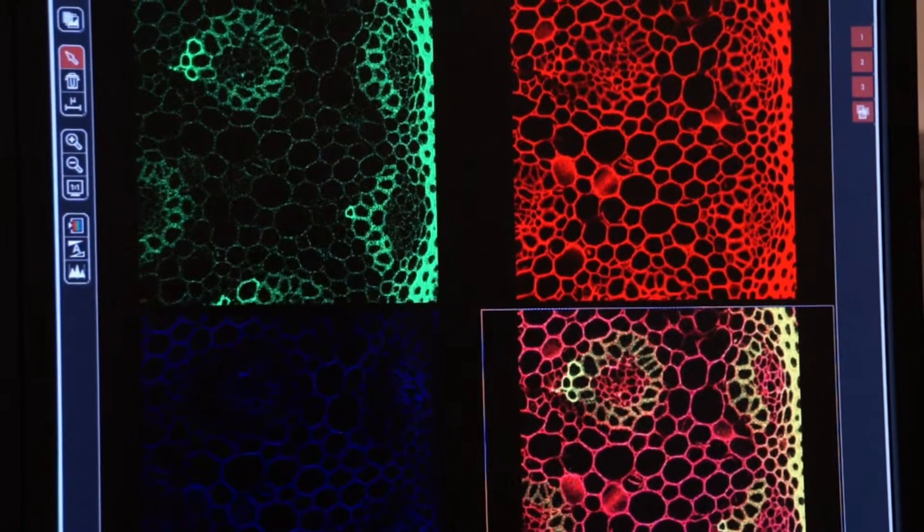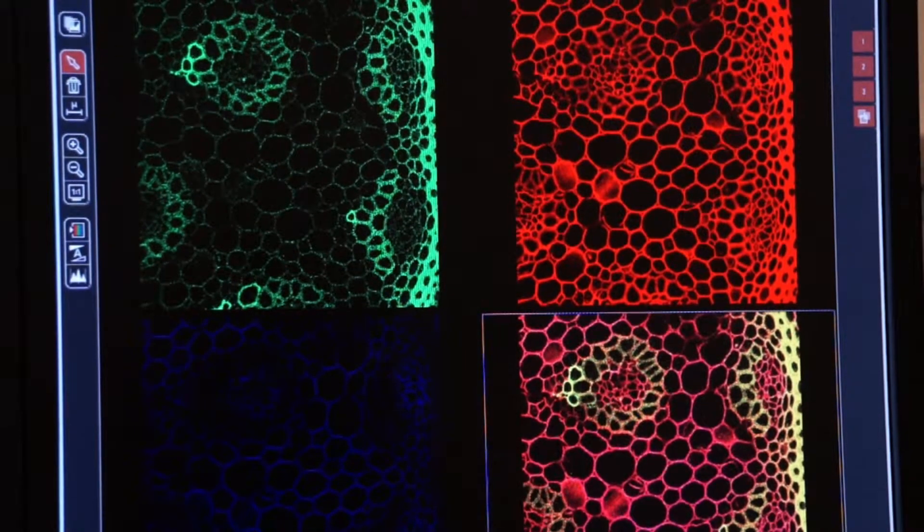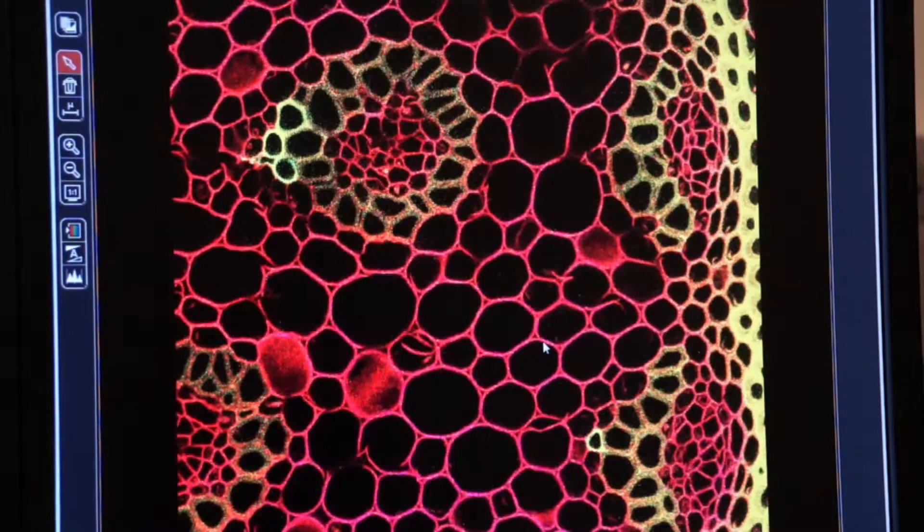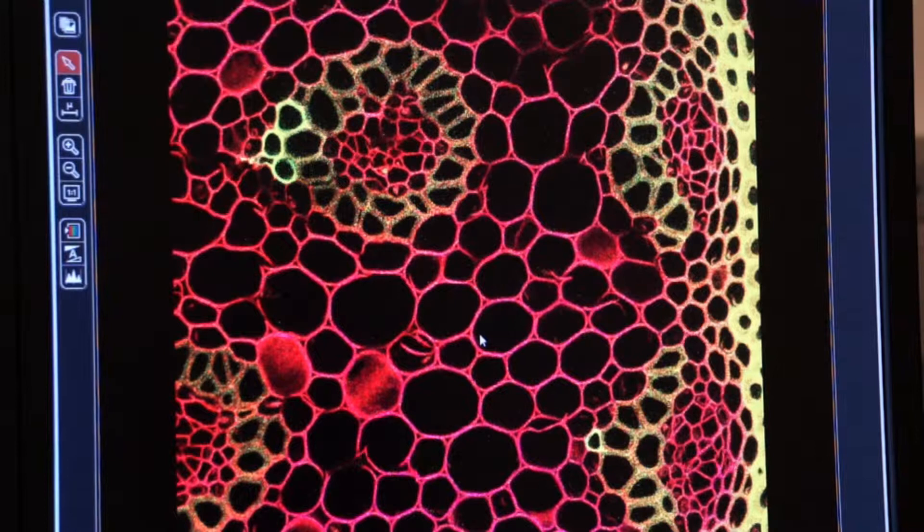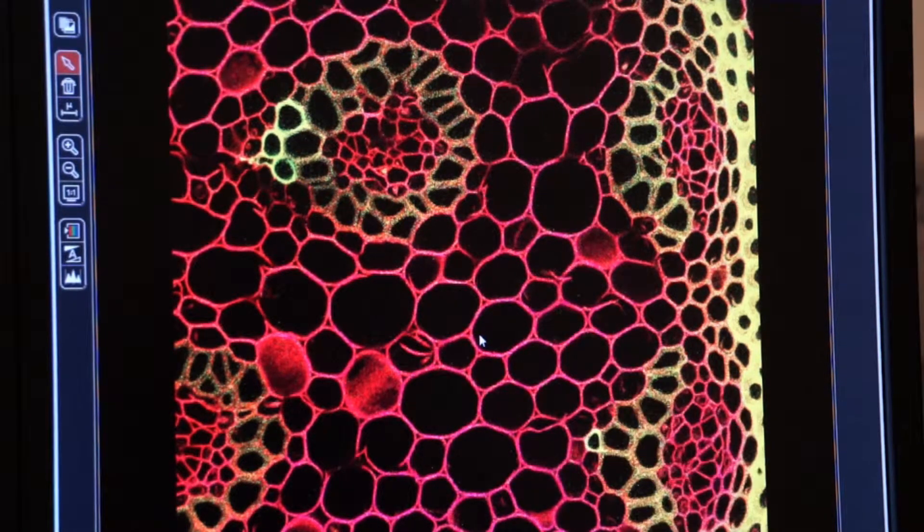It took a little longer that time. Why? Our resolution is doubled and now you can see it's a little bit better image but it's also becoming a little grainier.